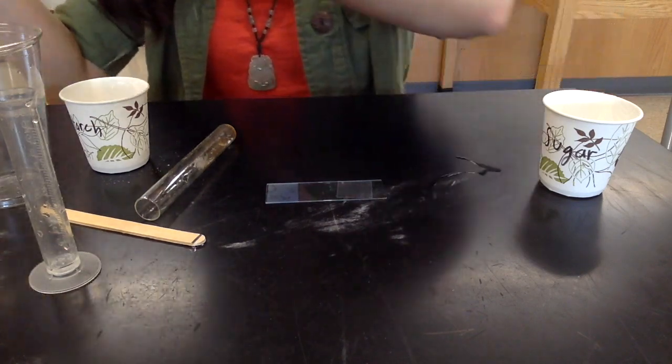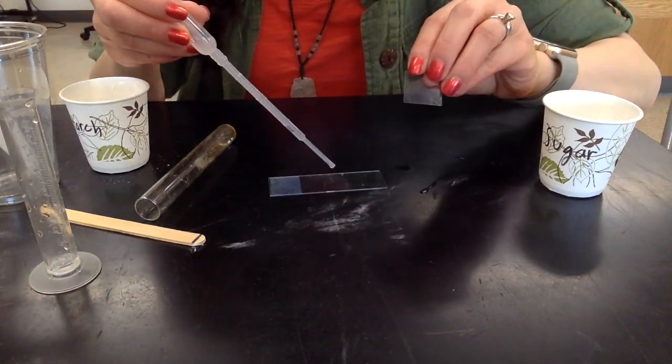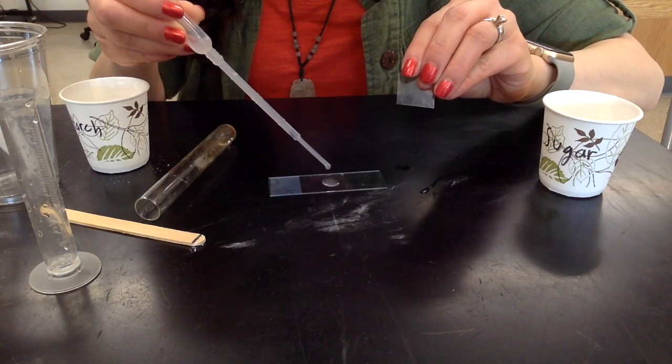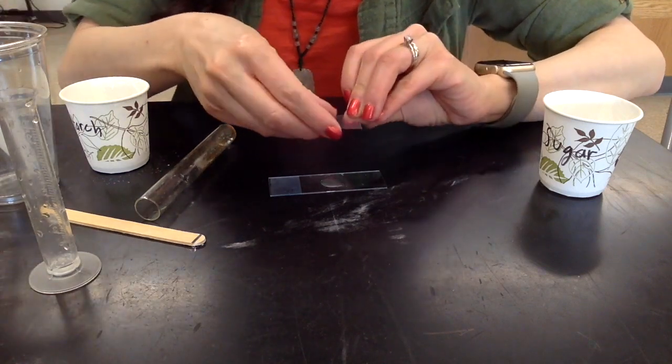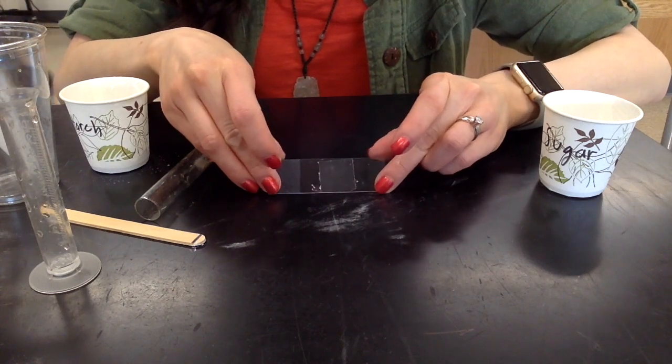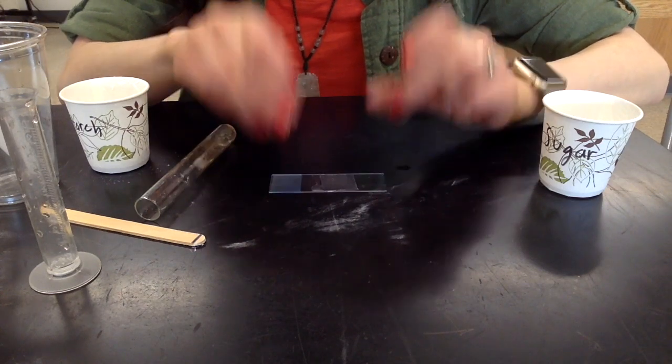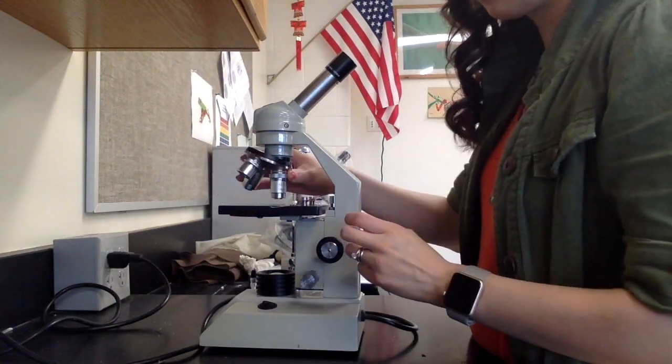After each solubility test, you will be taking the liquid in the test tube and preparing a microscope slide of that liquid. You will carefully look at those slides under the microscope and answer some questions about your observations.